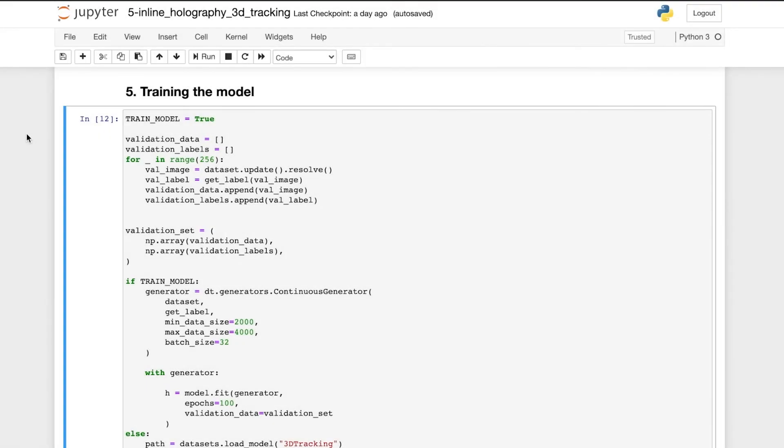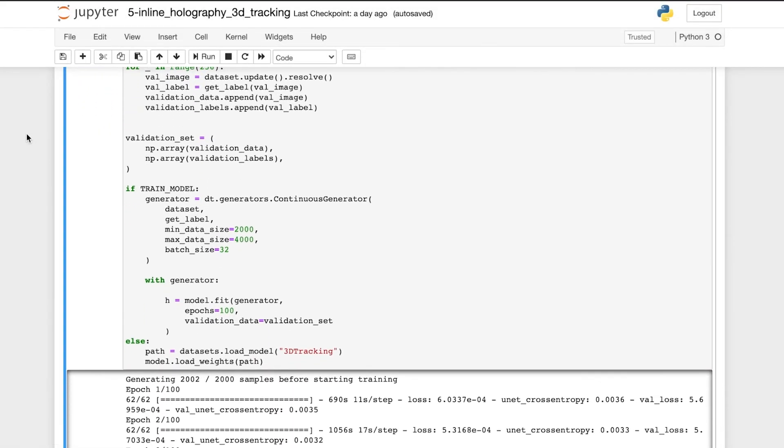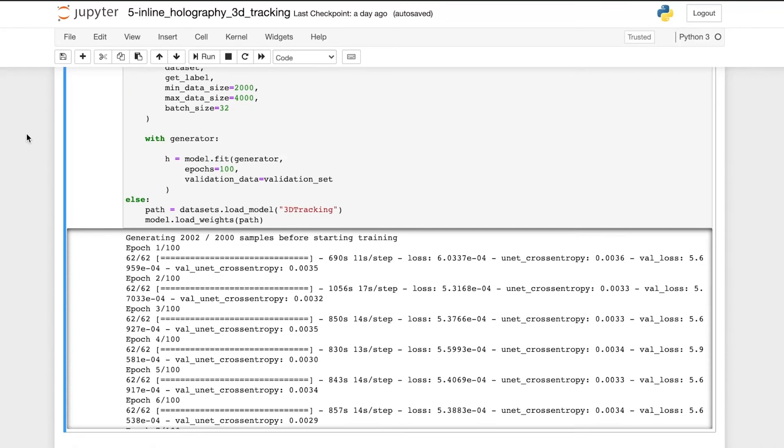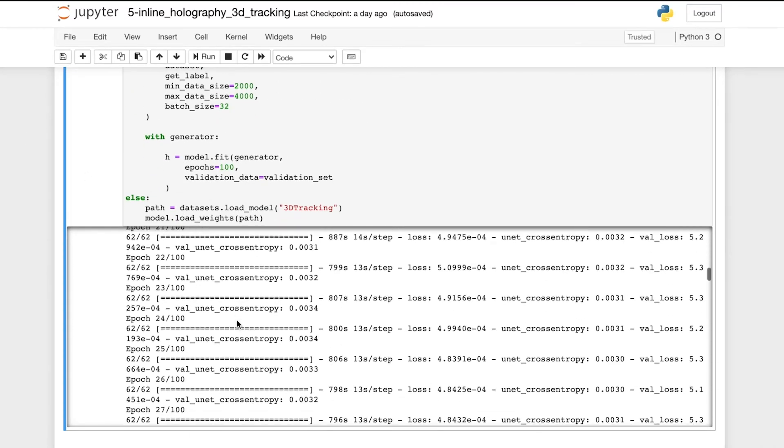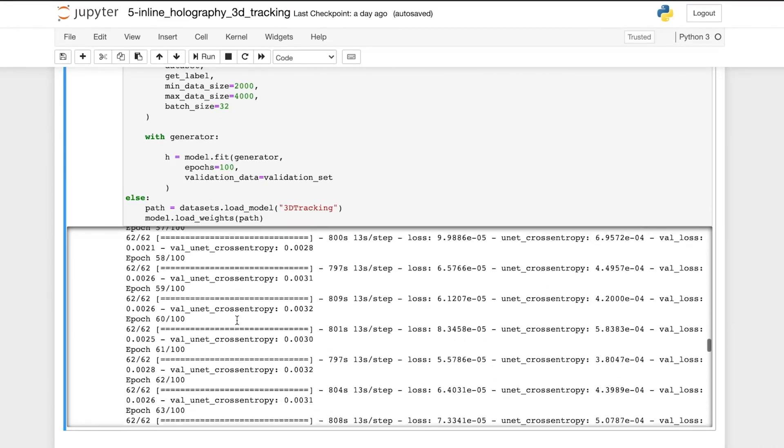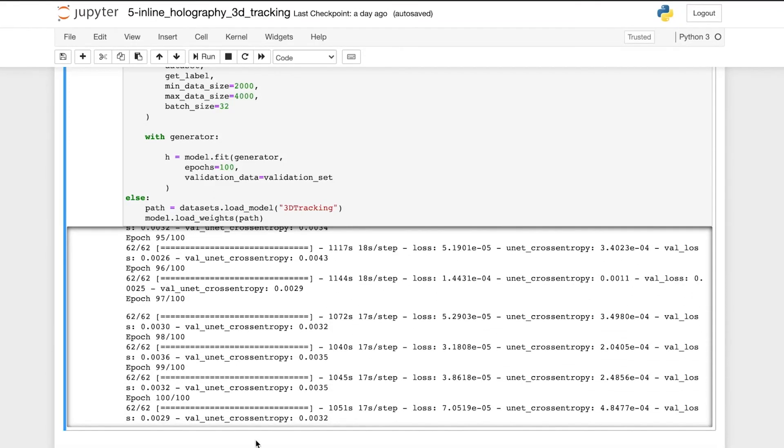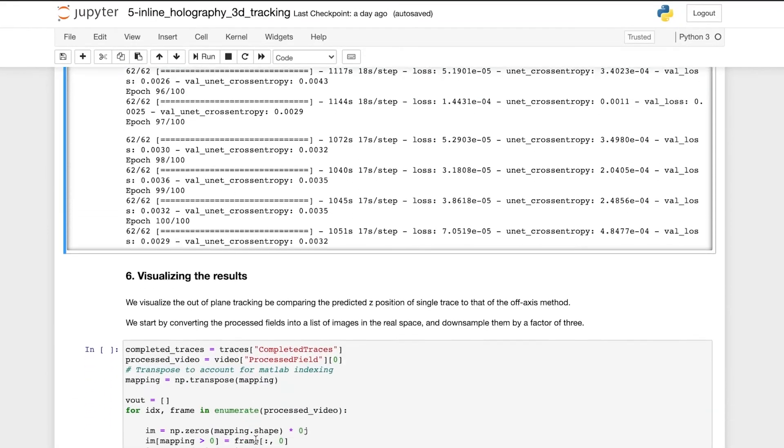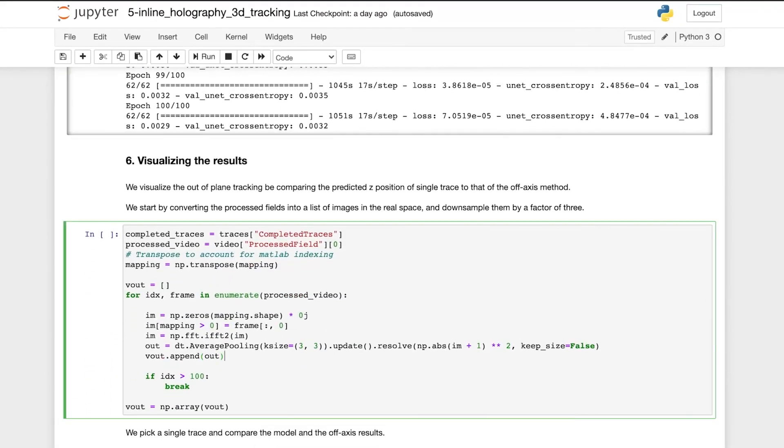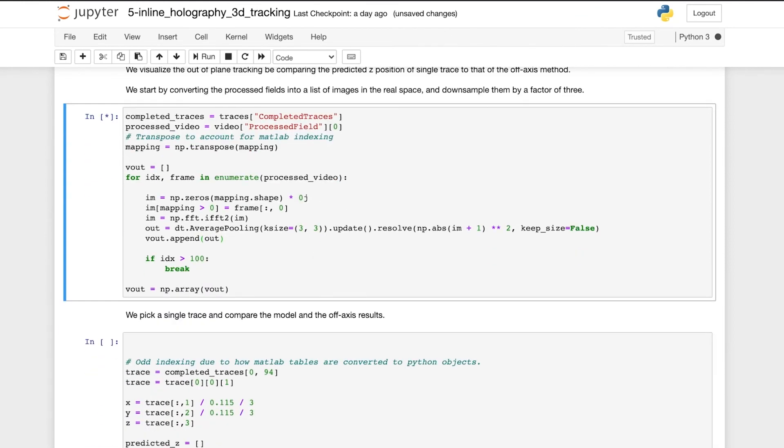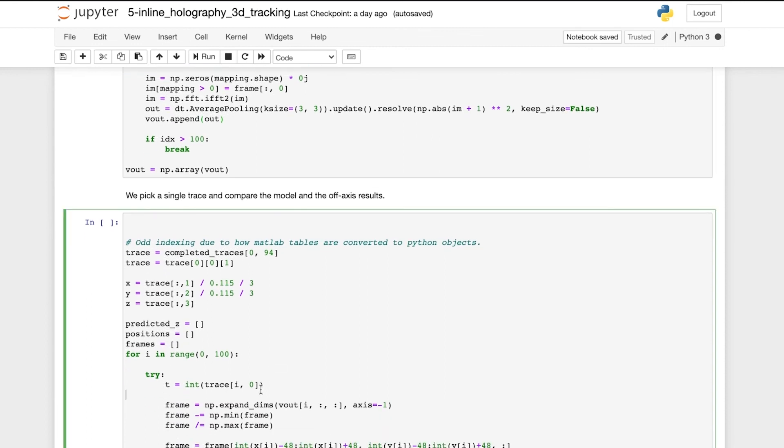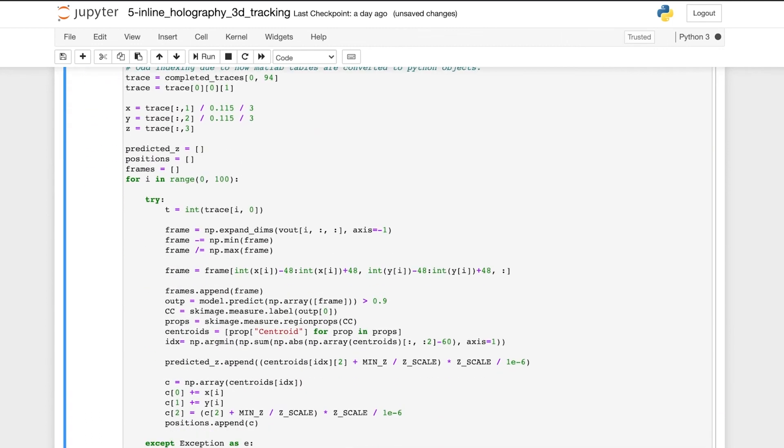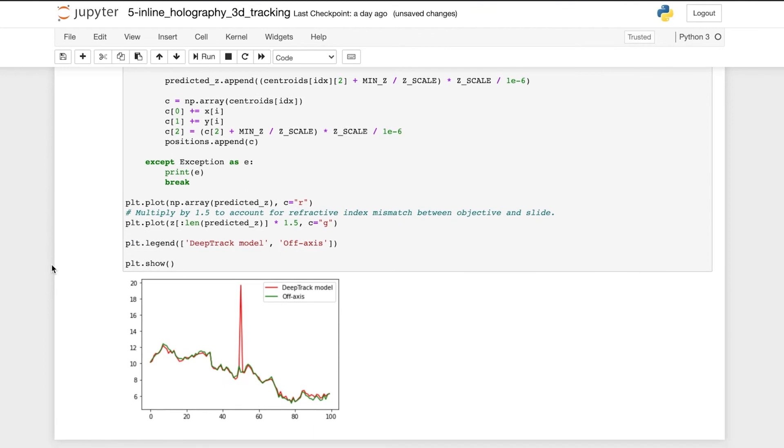After the training is completed, we can visualize the training and validation loss. And now we evaluate our trained network. We predict the 3D position of a single particle trace in a video and compare it to the prediction from a standard off-axis method, where the red line represents the prediction by DeepTrack and the green the standard off-axis method. And we see that the two methods validate each other.